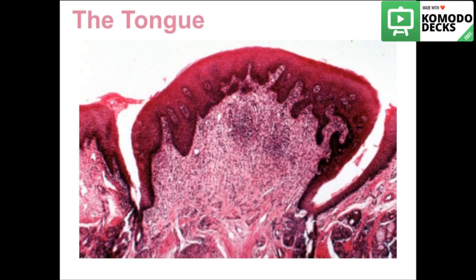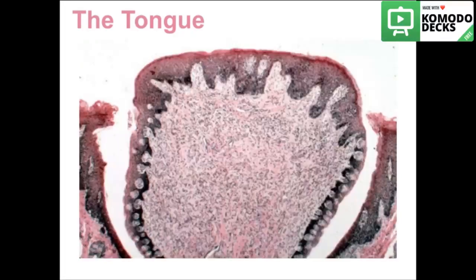Similarly, a circumvallate papilla with both trenches. A higher magnification showing numerous taste bud organs on the lateral side of the papilla.